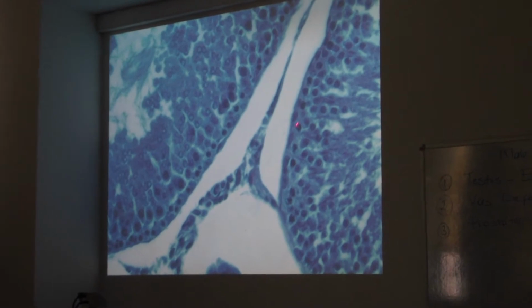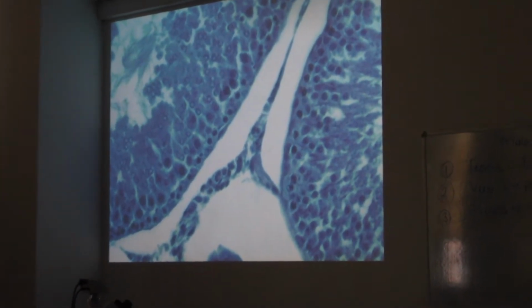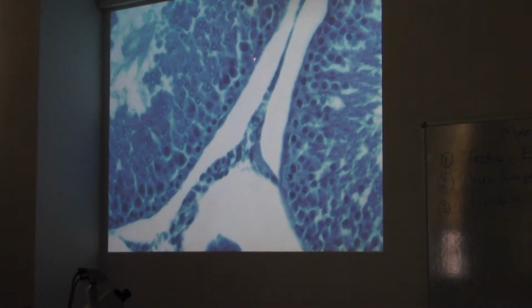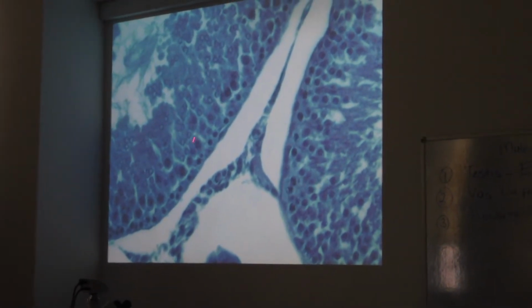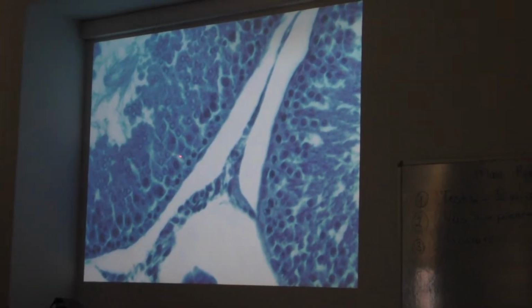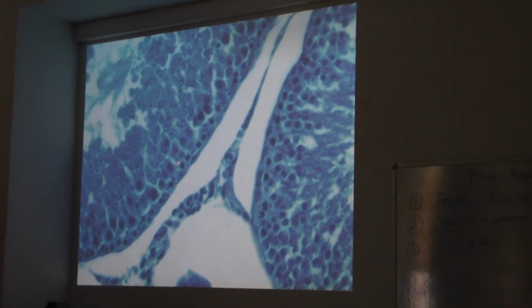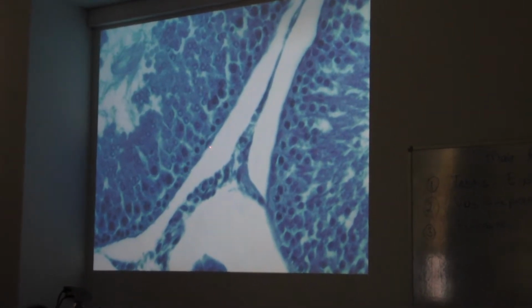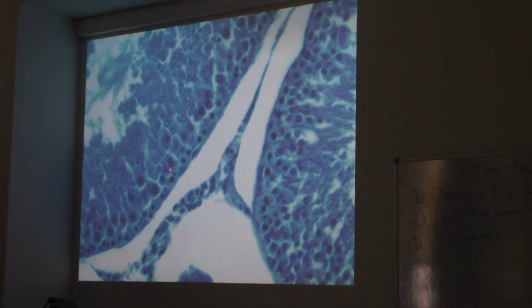And after spermatogonia, there are meiotic cells, primary spermatocytes. And in this tubule, these are these cells here. Very big cells, because they are replicating their DNA here. Here is the nucleus and the cell. They are replicating their DNA, therefore they are very big, and I can distinguish them easily from the spermatogenic cells at the base and Sertoli cell. And here is the primary spermatocyte.